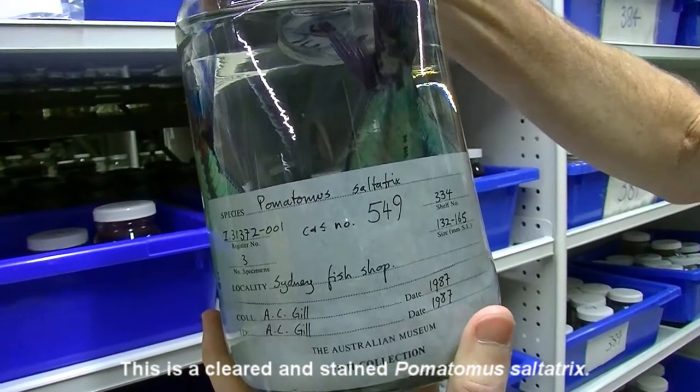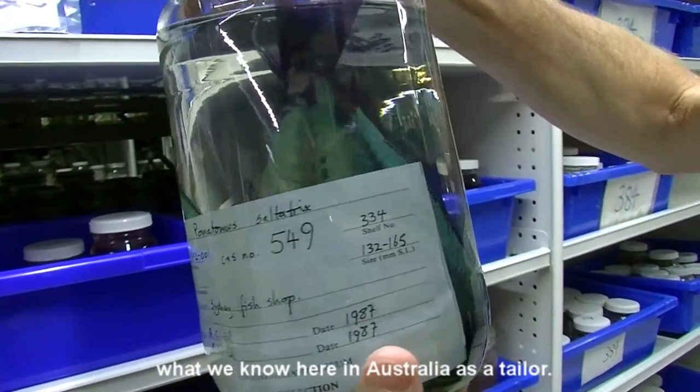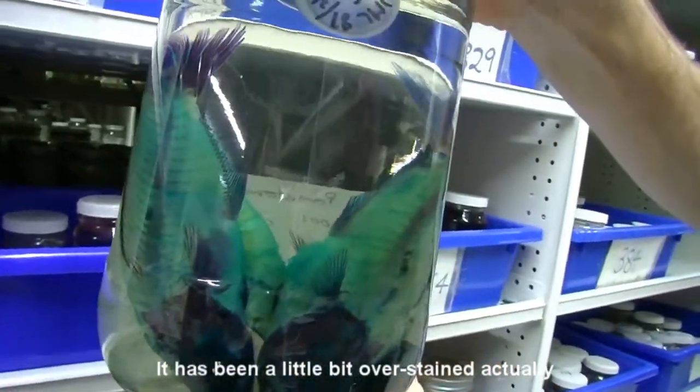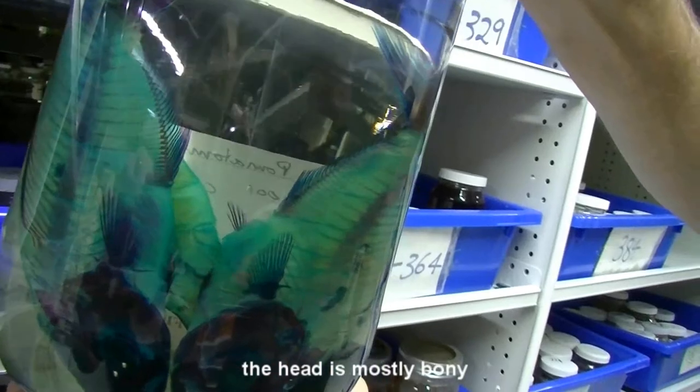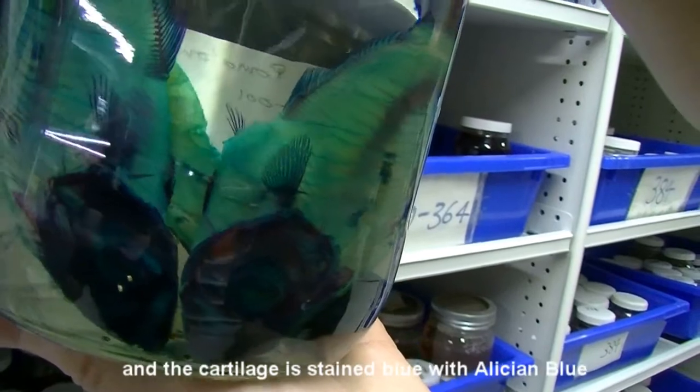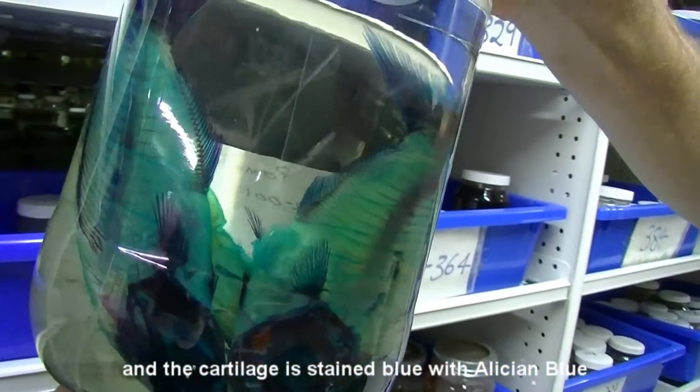This is a Cleared and Stained Pomatomus saltatrix, what we know here in Australia as a tailor. You can see it's been a little bit overstained actually, but you can see the head is mostly bony, stained red with alizarin red, and the cartilage is stained blue with alcian blue.